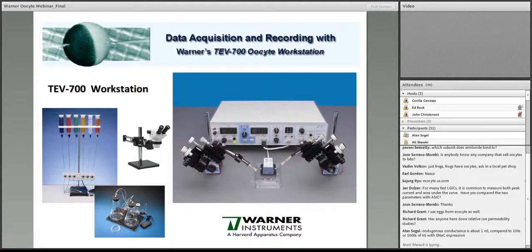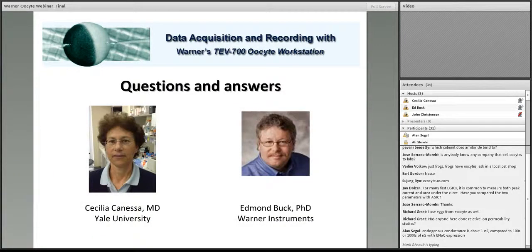One of the questions from the group was, what data acquisition system and data analysis software do you use in your research? We have used many things over time, but most people use the Axon software, or we have used also HEKA, and also we have used AD Instruments LabChart, that is very good when you are recording slow events. So LabChart is really good.